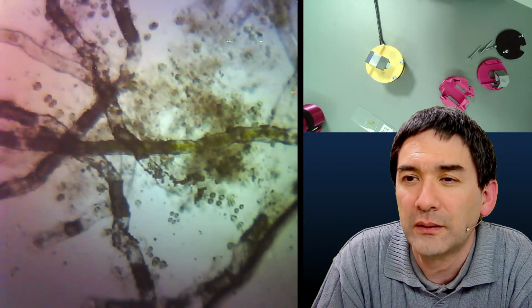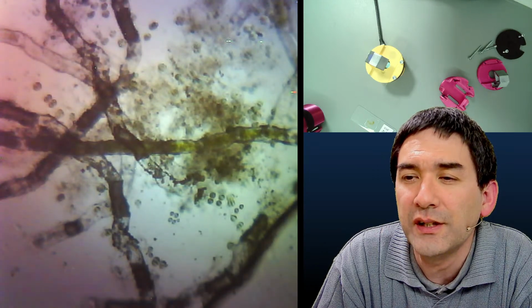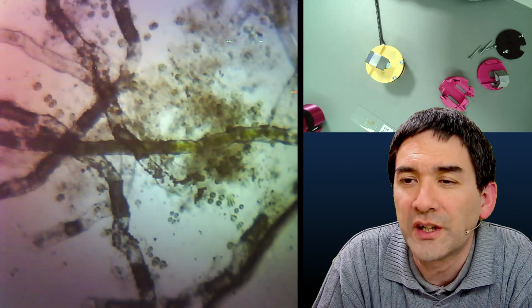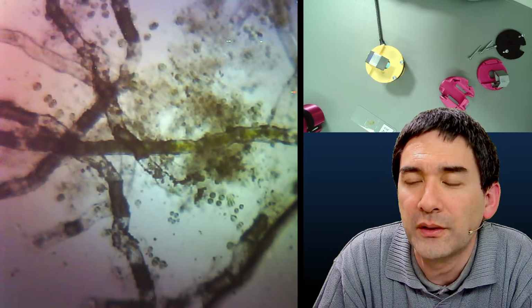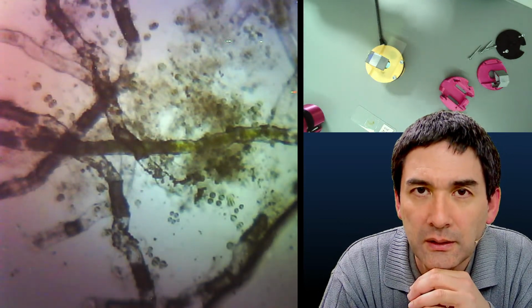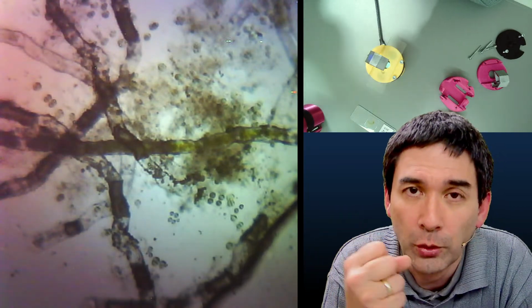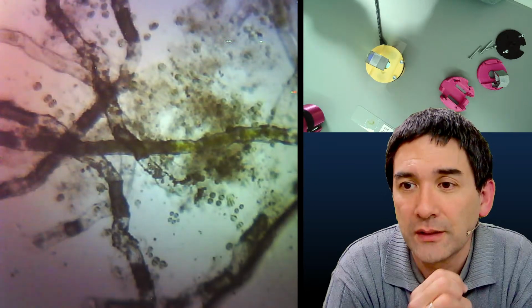I've been thinking, basically we all have smartphones. That would result in a much better quality, connecting a smartphone, and it wouldn't be as expensive. We won't need a camera module, only a very strong magnifying glass. Yep. So basically, there are things that you can buy, which are not meant to be microscopes, but macro attachments that you can connect over your mobile phone, and then you can go much closer to get macro images.